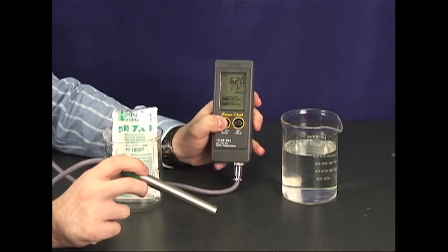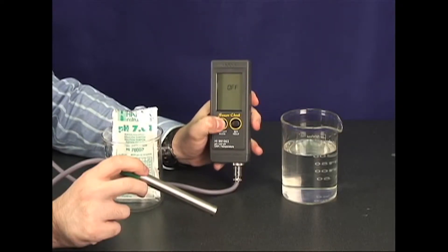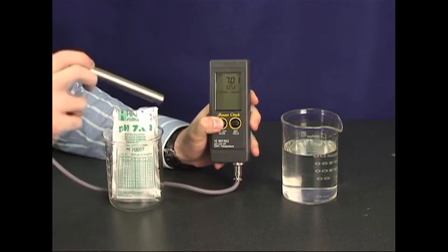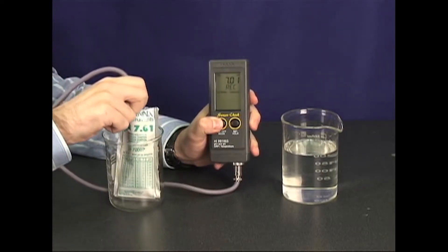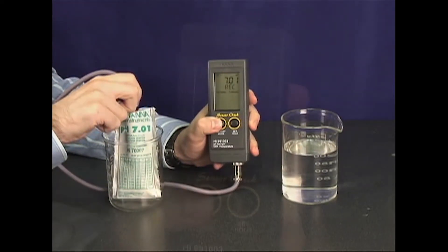To calibrate, hold the mode button down for three seconds until the meter prompts you to use seven buffer. Then place the probe in the seven buffer and calibrate. It's that easy.